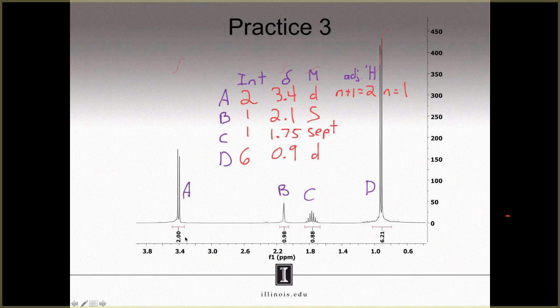If you look at B, that's a singlet, so that's 0. If you look at C, that's a septet. That's got to be 6. 7 peaks, 7 minus 1 is 6. And D is another doublet, therefore that signal has only one adjacent proton.